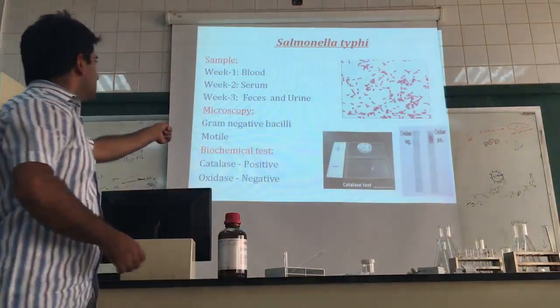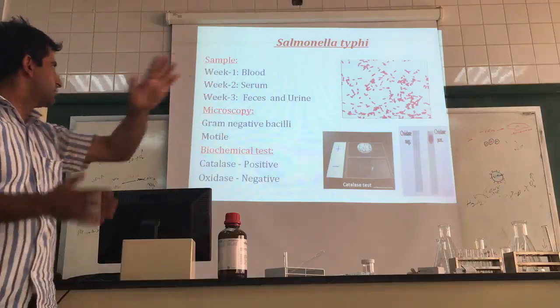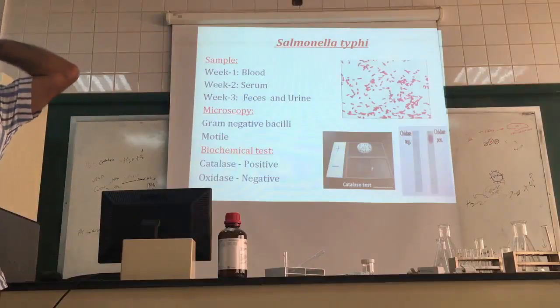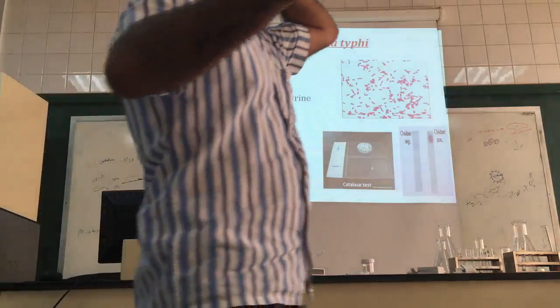So this microbe is catalase positive. You see the bubbles here? It's positive, and the other is negative. Now, what is oxidase? If this microbe is oxidase negative, what is oxidase? You forget? Okay, you have a lot of things to do.